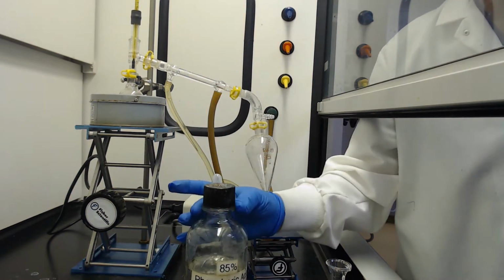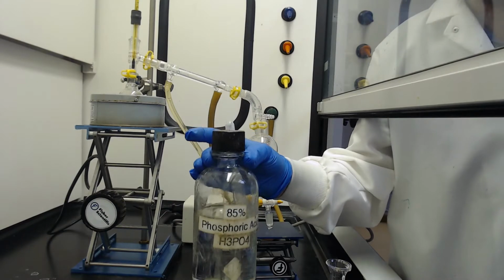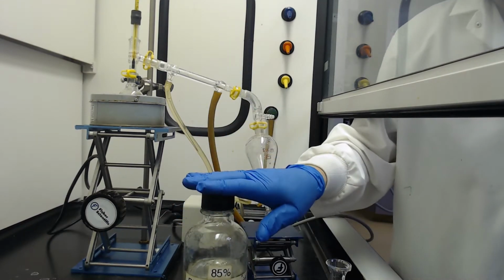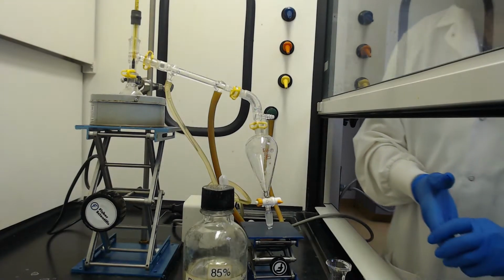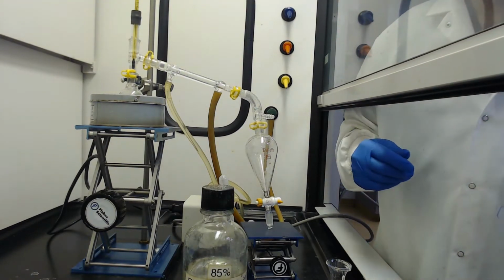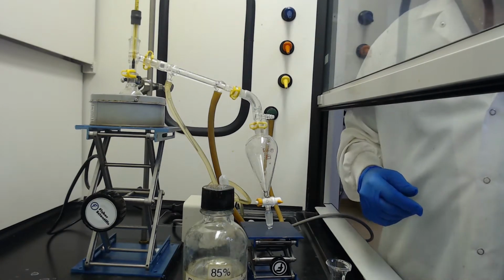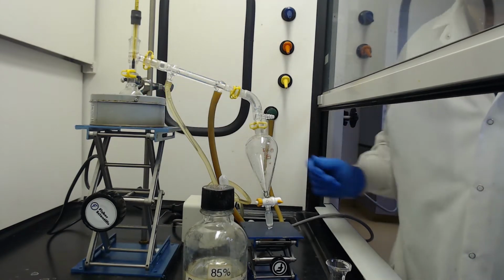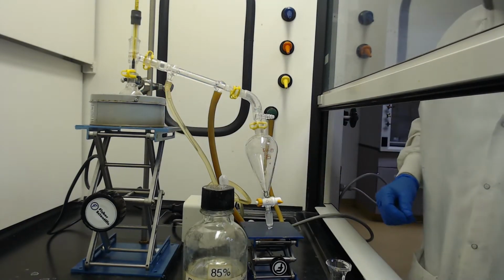It's considered a weak acid, but it's actually a fairly strong weak acid. So you do want to be careful when you're handling that. Another very important thing that you can't see right now, and I actually put these in before when we tared it over there, is that there's boiling chips inside of this flask, so we prevent bumping.